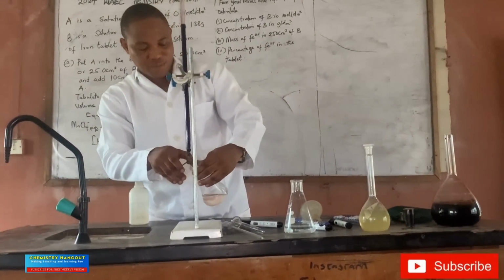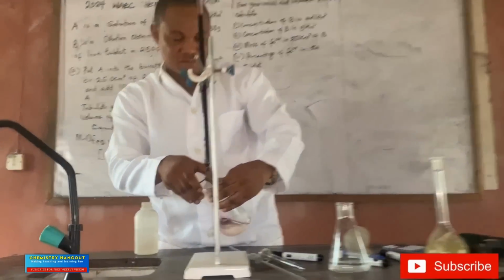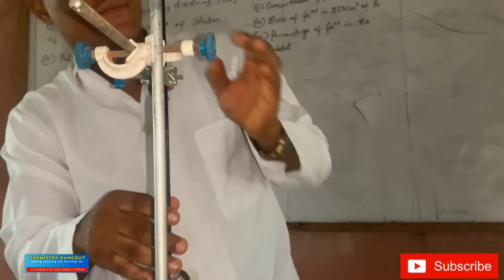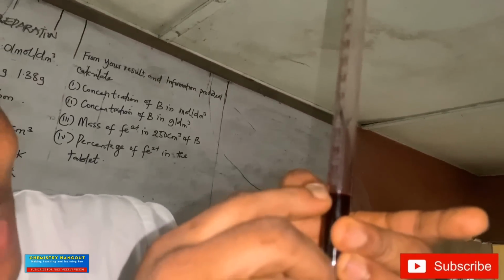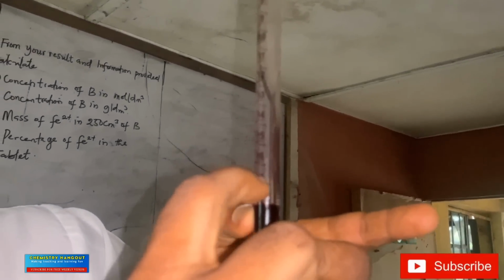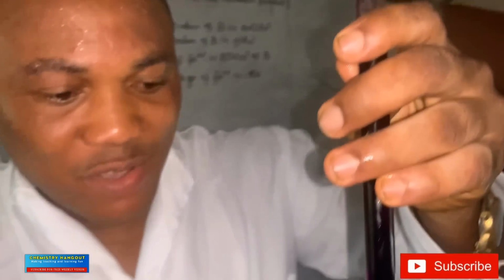Let's go. It's remaining to change now by a drop. You can see. Gently. See that now? Can you see that now? Let's check again. Okay, this time around, let's zoom it. Okay, this is 18, I think. This is 18.12. Okay, I'm having 18.3. You can see this is 18 now. Is this 17? Let me see. Okay, this 16, sorry. Okay, this 17. Oh, this 17.5. This 18 now.